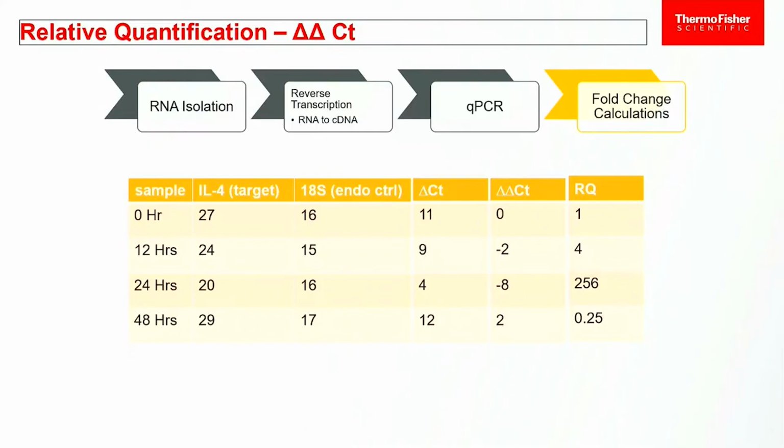We have a fundamentals guide, what do we call it? The handbook. We have a qPCR handbook outside that is a great reference. It's also available online, and it goes into a lot more detail about how to collect and do the RQ data analysis. I think that would be good for you to sit with and understand where I'm coming from. But I think you're doing it the right way. You're just doing that transformation at a different point, and I think we're getting to the same end result.